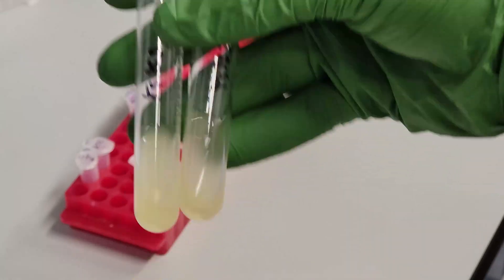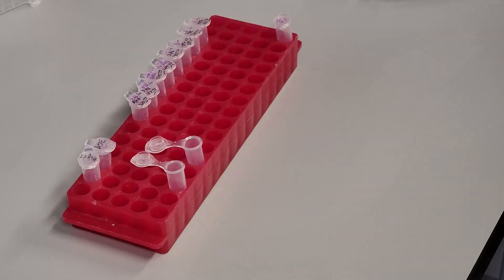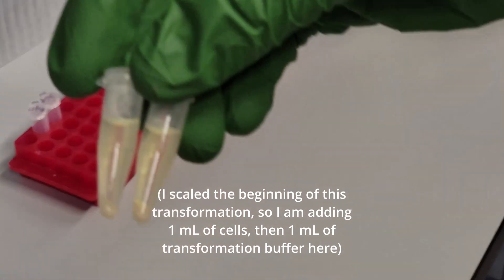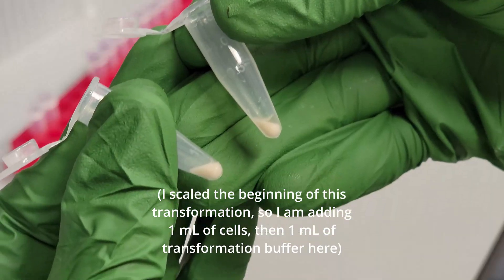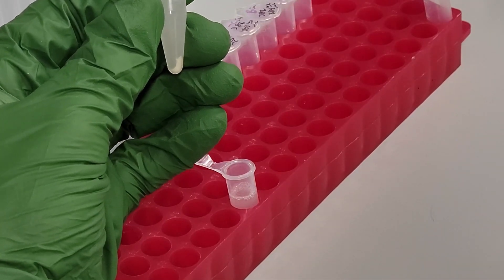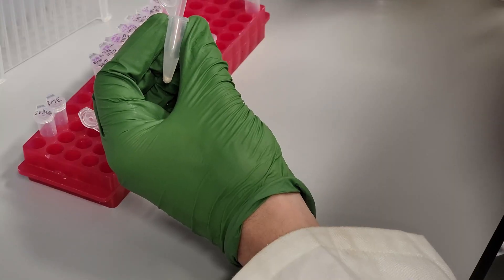To start, I grow some PO1F yeast for 16 to 24 hours. This can be done in rich media like YPD or in synthetic media. The growth time or source of your cells is very unimportant here. I've taken a culture that was sitting on my bench for two days, added a mil of YPD, grew for two hours in the incubator, and the transformation still worked. Transfer 250 microliters of this liquid culture to a 1.5 milliliter centrifuge tube. Spin at 4000G for two minutes, pour off the supernatant, and re-suspend in 250 microliters of transformation buffer. Spin again and pour off the supernatant. Re-suspend the pellet in 100 microliters of the same transformation buffer.